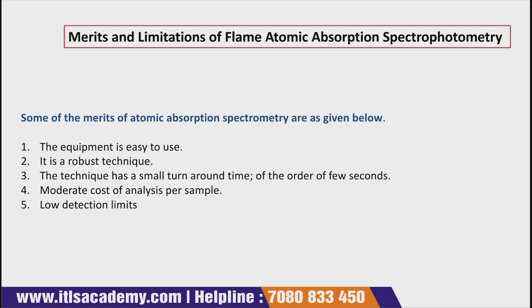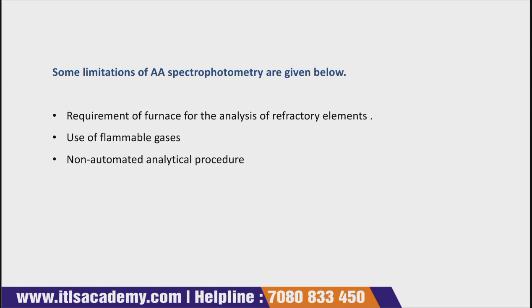Similarly, the cost of the analysis per sample is very moderate. So of course, this becomes the key factor. That is the reason it is widely used in different industries, and if you see their cost, the cost is very low. Now comes the limitation.